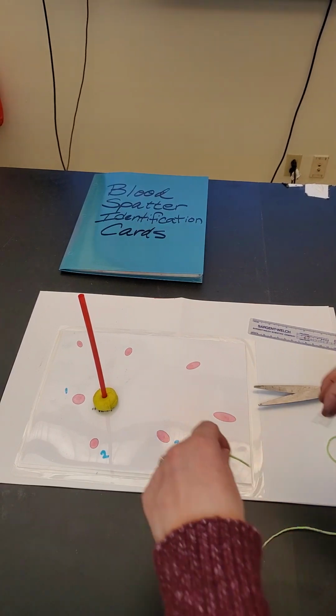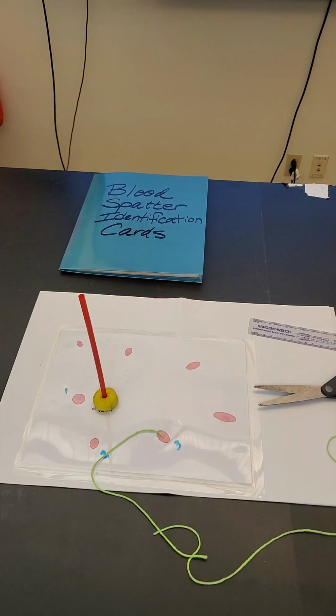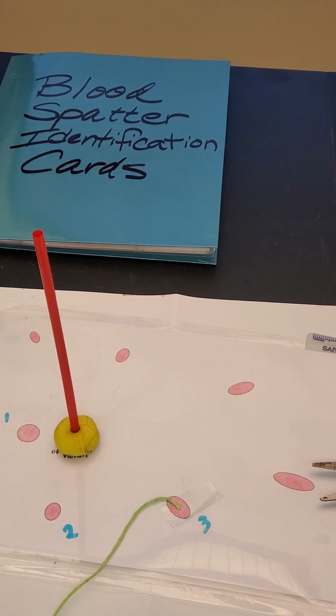I'm going to tape it to the center of the drop. Did you see that? The center of the drop. Okay, just a little close up here so you can kind of see it. I'm going to bring it back into the frame. There you go. So what I'm going to do now is take my protractor.